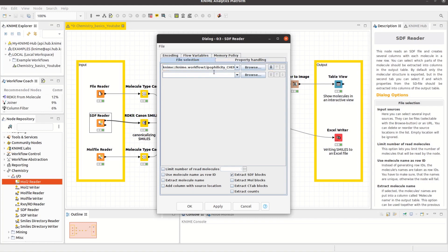If you want to extract the whole molecule, for example, you can choose Extract SDF blocks. By selecting Extract Mole Blocks, only the mole blocks without properties are extracted.